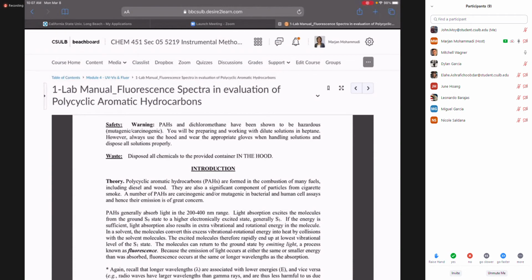Sometimes you will see that, if you go into detail on the fluorescence data, the lambda where you get the highest peak is shifted a little toward the higher one. For example, for anthracene, absorption happens at 288 nanometers, so we know that we are going to get the maximum for UV-Vis at 288.